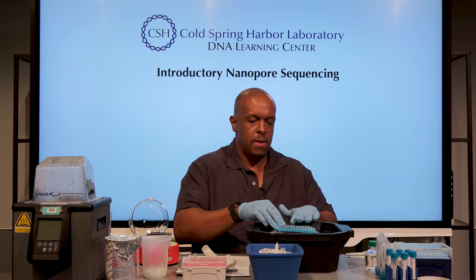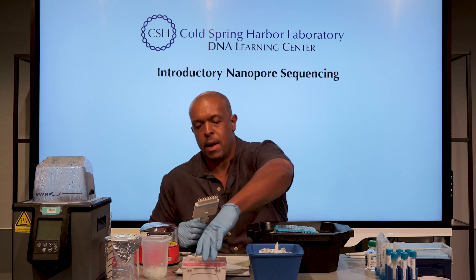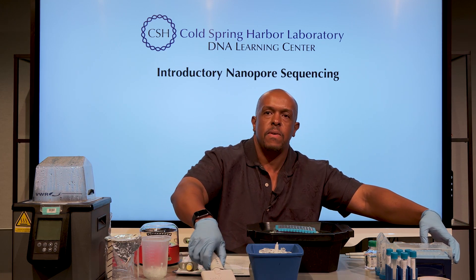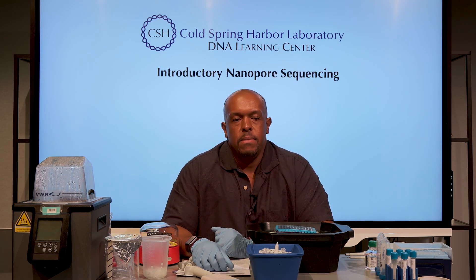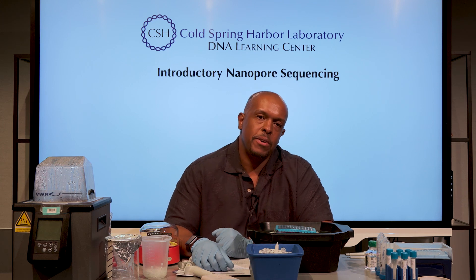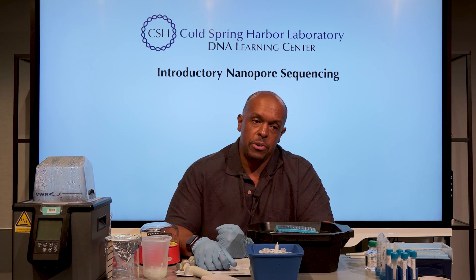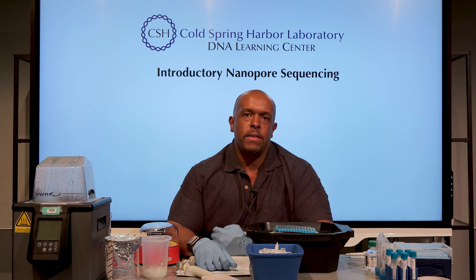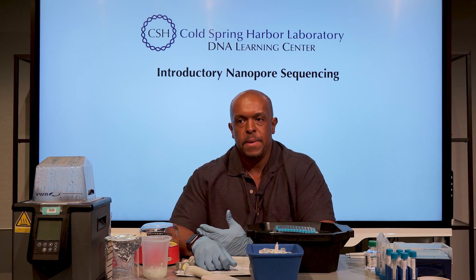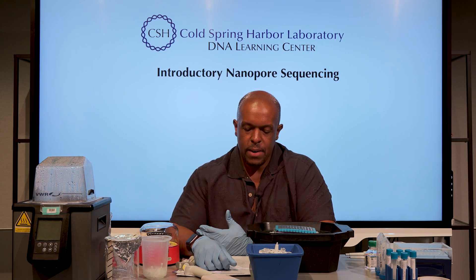You'll follow the directions for PCR. I have some additional recommendations: the nanopore protocol has you do the PCR for 25 cycles, but I've experienced that some students didn't get anything from their shoe sample. That may be because it's a very sparse sample — that's reality. In this case, we're not necessarily being quantitative, so I actually increase the number of cycles to a higher number.